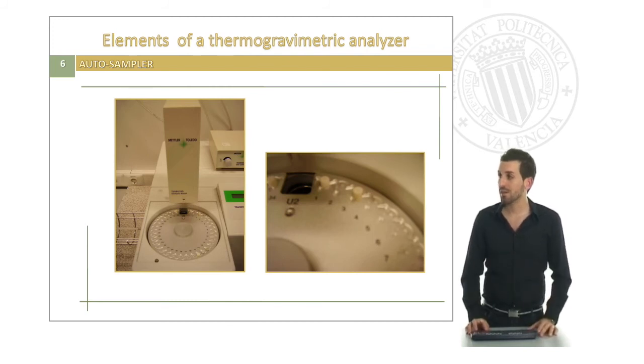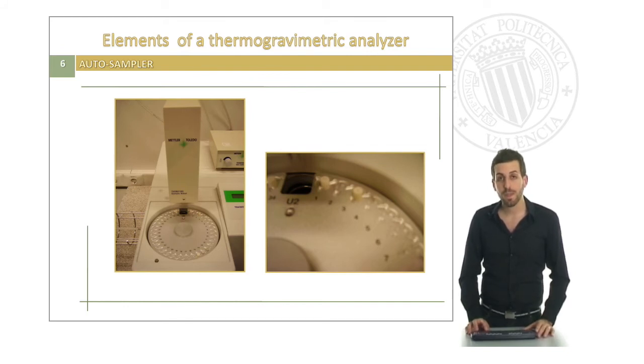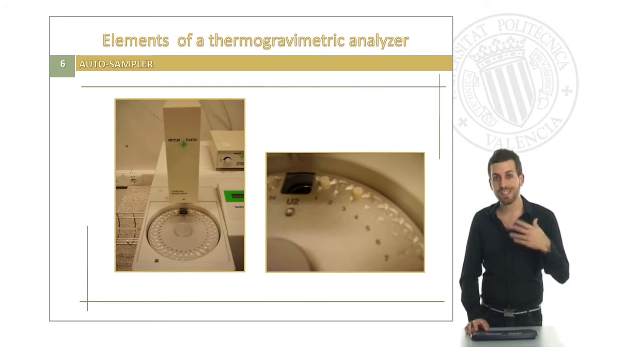Then we have an autosampler, which is good to prepare different experiments, up to 34 experiments, which is good to design your method and your experiment procedure.